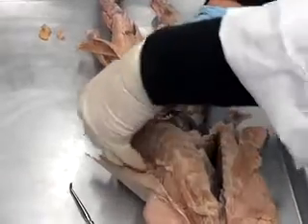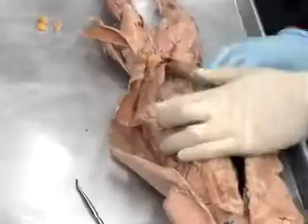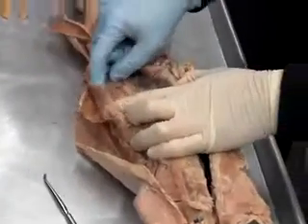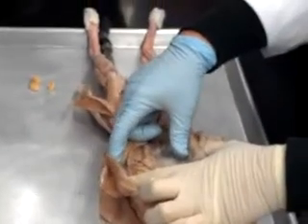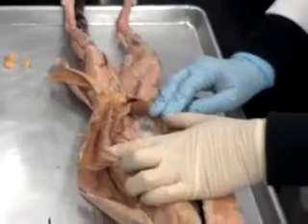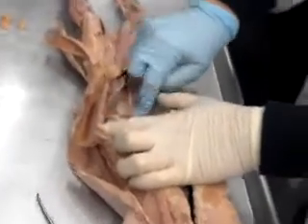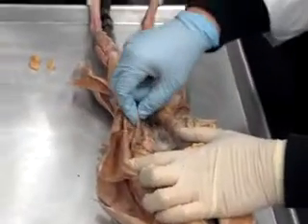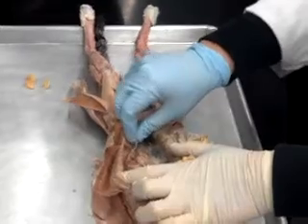Now we're going to look at the kidneys. And they are retroperitoneal, which means they migrated behind the peritoneum. So you can see that they're actually behind, but they're embedded in adipose tissue and connective tissue to help keep them in place. This is the kidney.